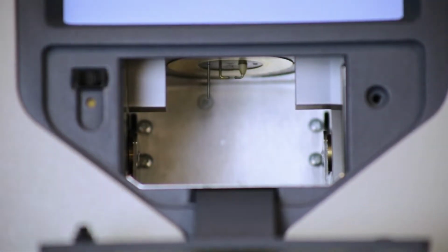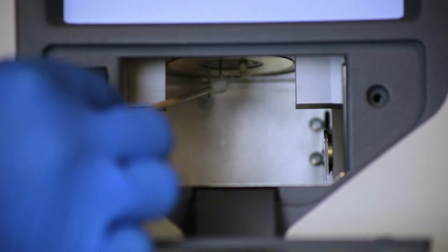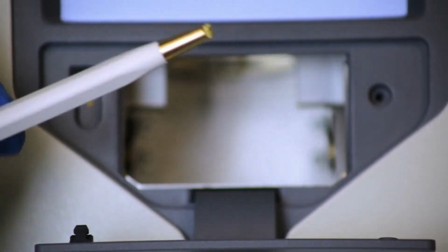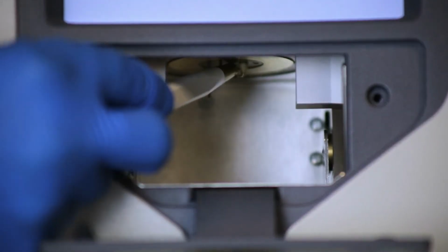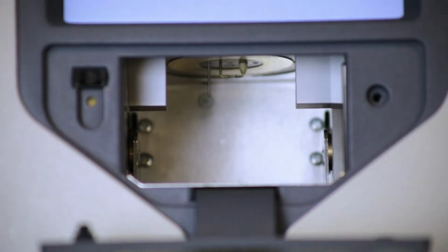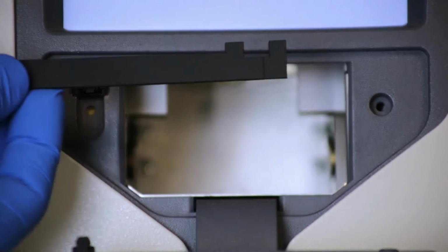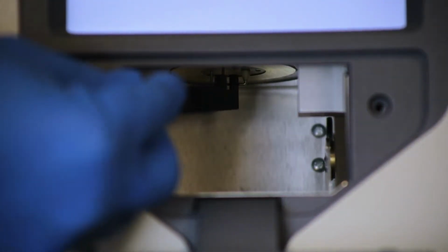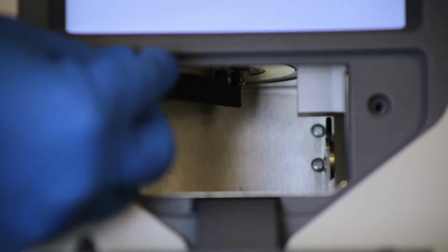If you cannot replicate a correct ignition, please make sure using your cotton swab that the residue is removed from the oven assembly and the electrodes. Also, in case of a heavier fouling issue, please utilize your brass eraser, gently scrub the arc pins and remove any residual. Finally, please insert your multi-distance measuring gauge between the center of the anode and cathode and verify that there is a snug fit.